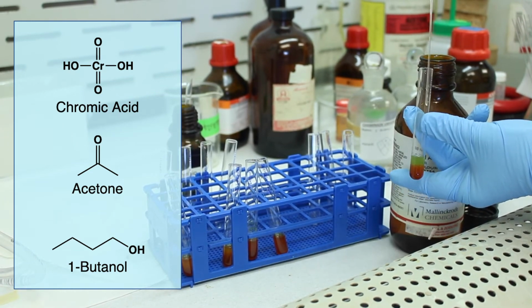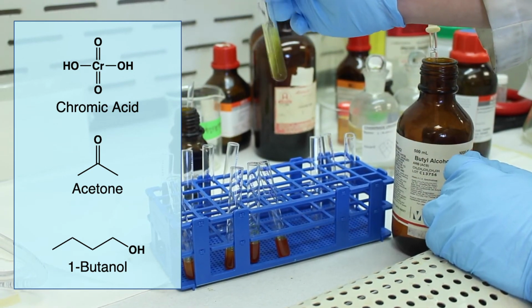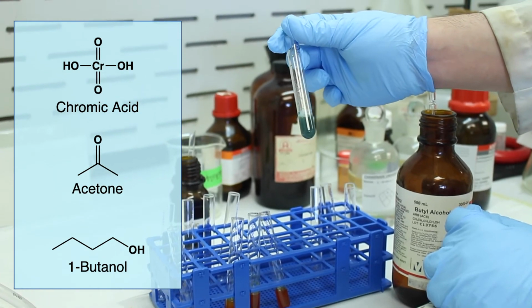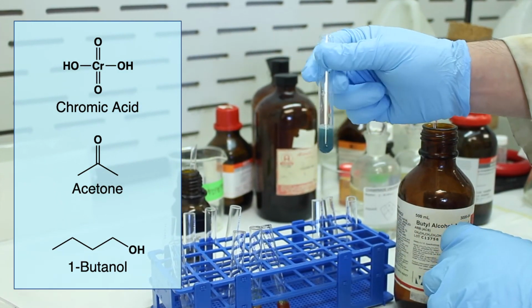Okay, you can see already there's a little bit of green there. And if we agitate the solution, you can see that the red color has pretty much disappeared. And now it's a grayish green-blue.